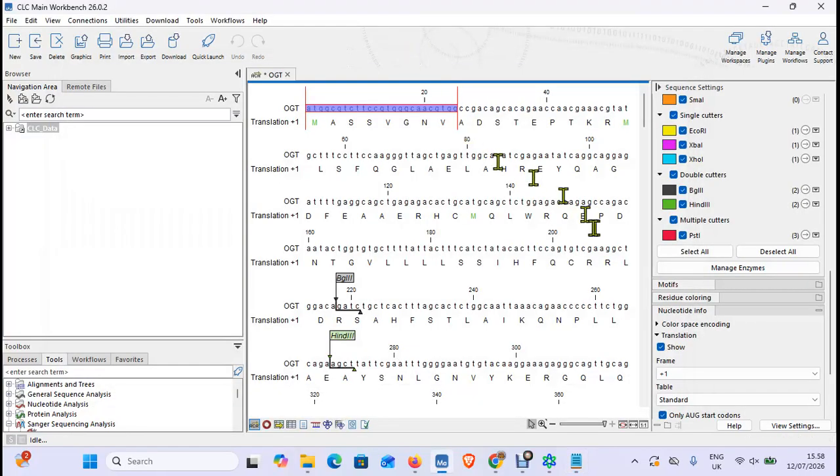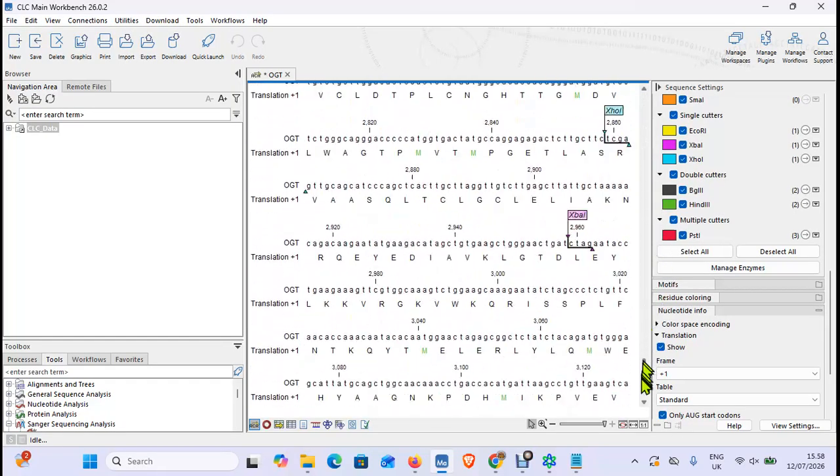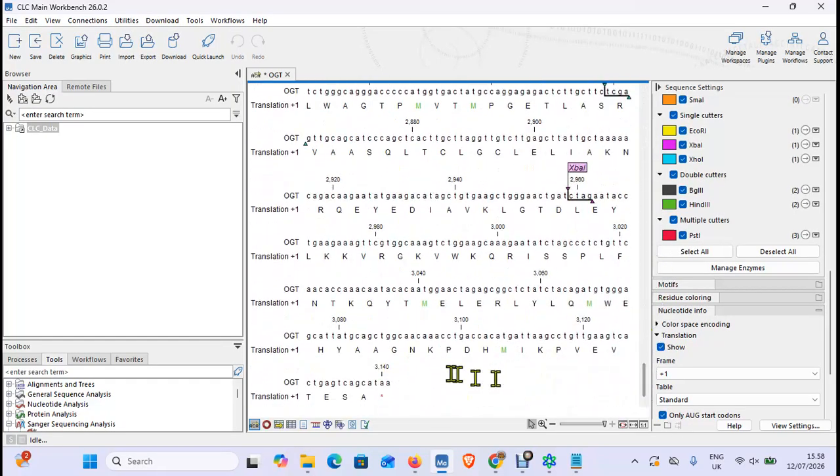So let's do the reverse nice and quick for the same thing, and then we can call it a day on this particular adventure. So, once again from the stop codon, we got 8, we got 12, we got 22, we got 30, 40, yeah, I need a better mouse, 52, 60, 70, 78.